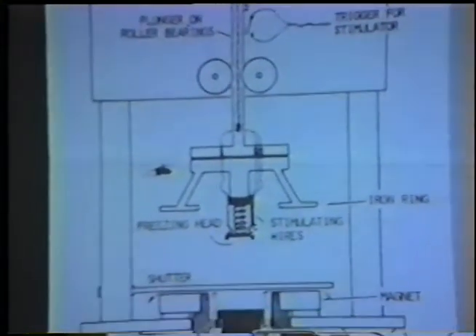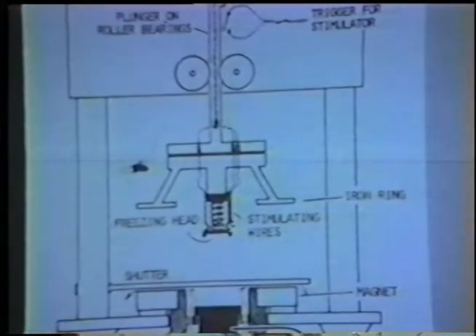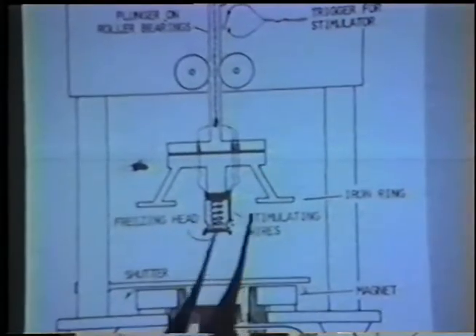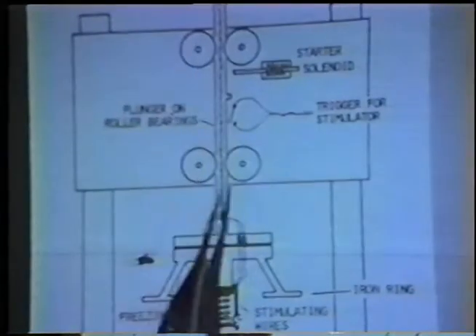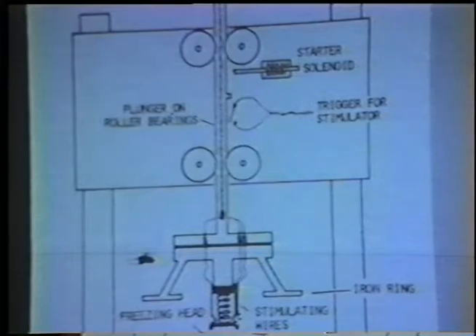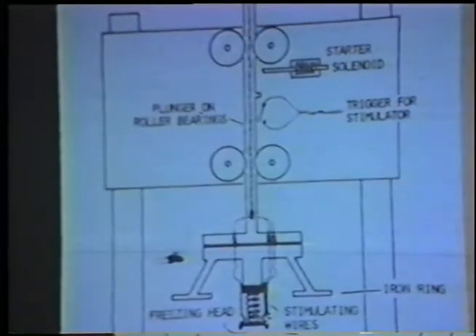You can use a piece of fixed lung tissue, you can use foam, you can use springs. There are lots of things that are used, and they all seem to work. And in this type of system, you can also stimulate the sample in various ways. You can have a muscle preparation or a nerve preparation here, run wires down, and stimulate it at some point during the fall. Now, this technique is very good for doing timing studies.